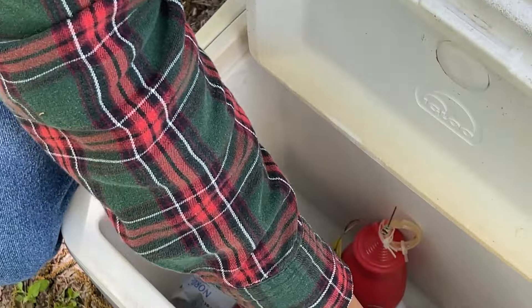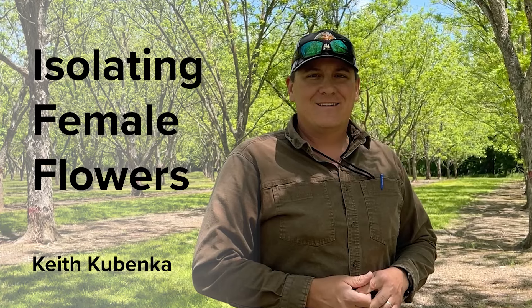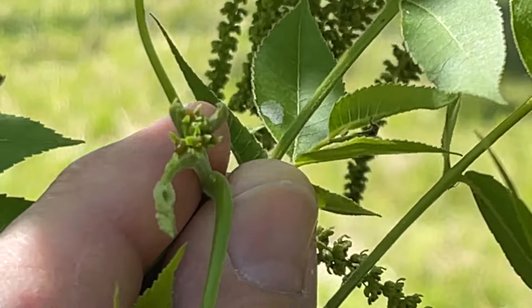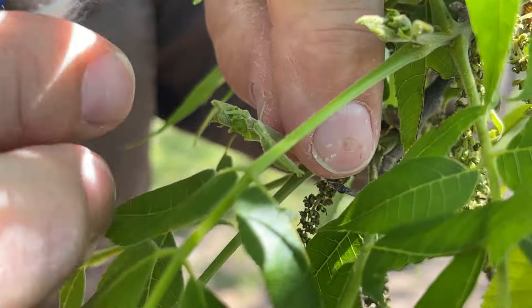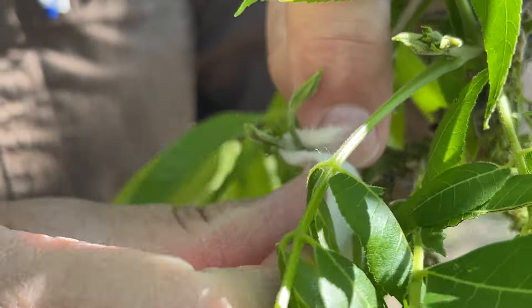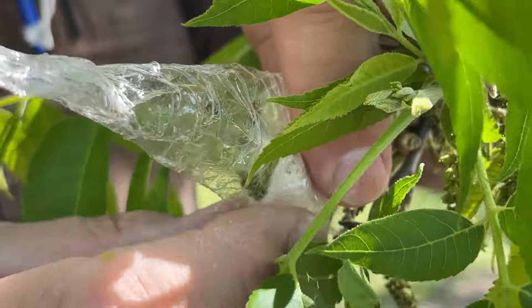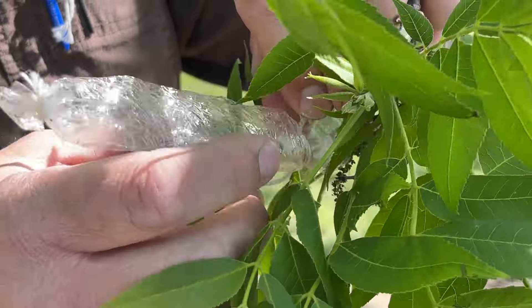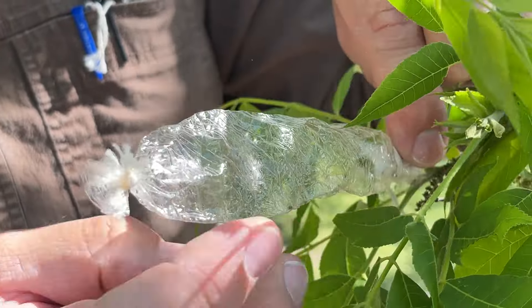The pollen is early maturing and we need big nuts. This is the stage where you basically isolate the flowers from foreign pollen before pollinating them, so you can apply the pollen you want for your controlled cross. Pinch off one leaf, wrap cotton around it to protect the stem, then apply a pollen bag over the top, tie it on, cinch it down, give it a tug to make sure it's secure, and that will keep it protected from foreign pollen until you can apply your desired pollen.